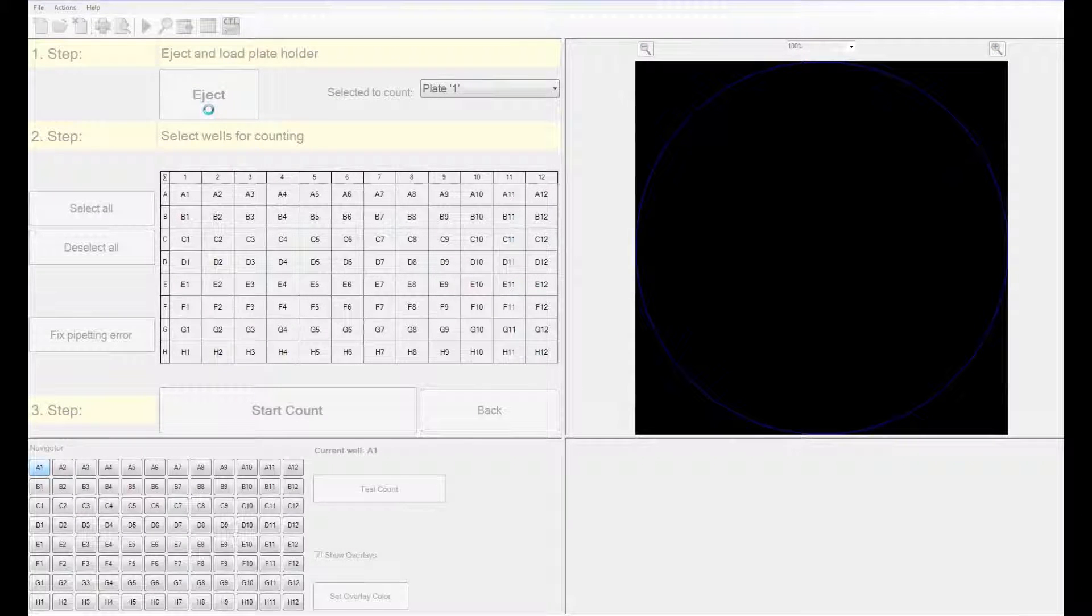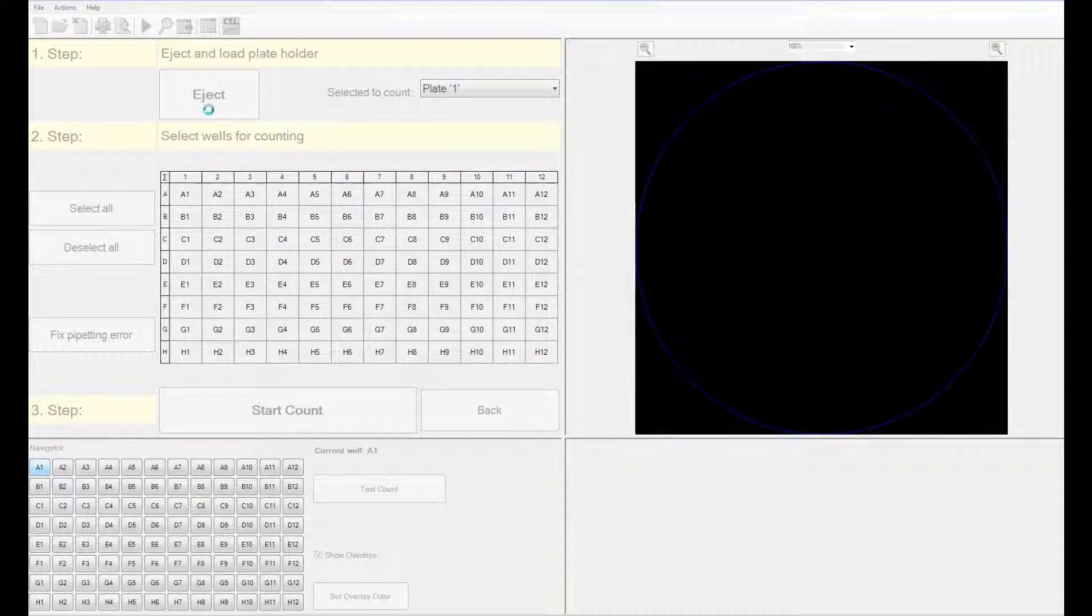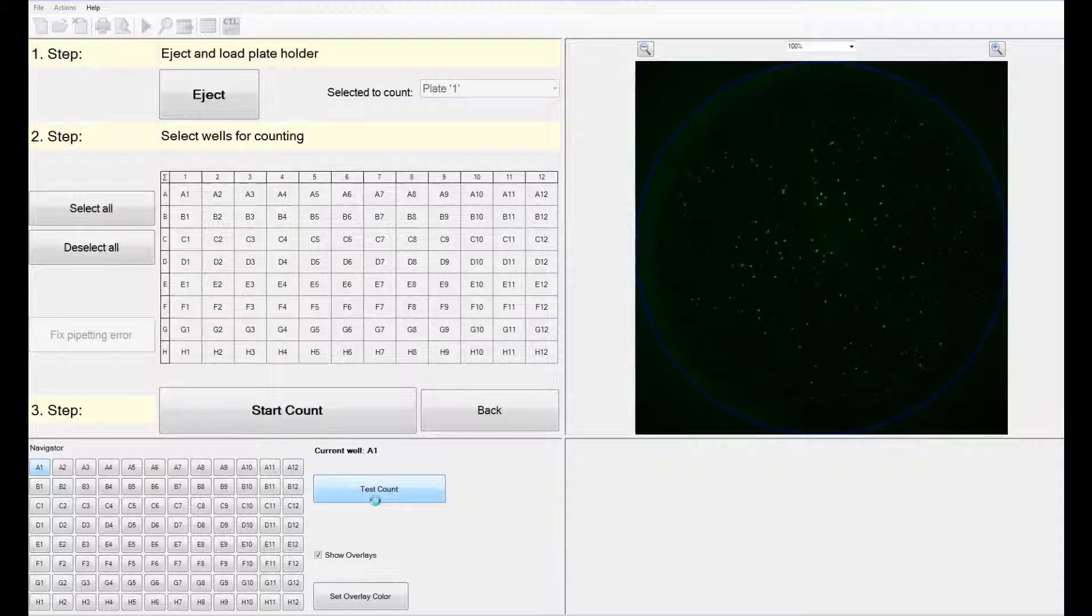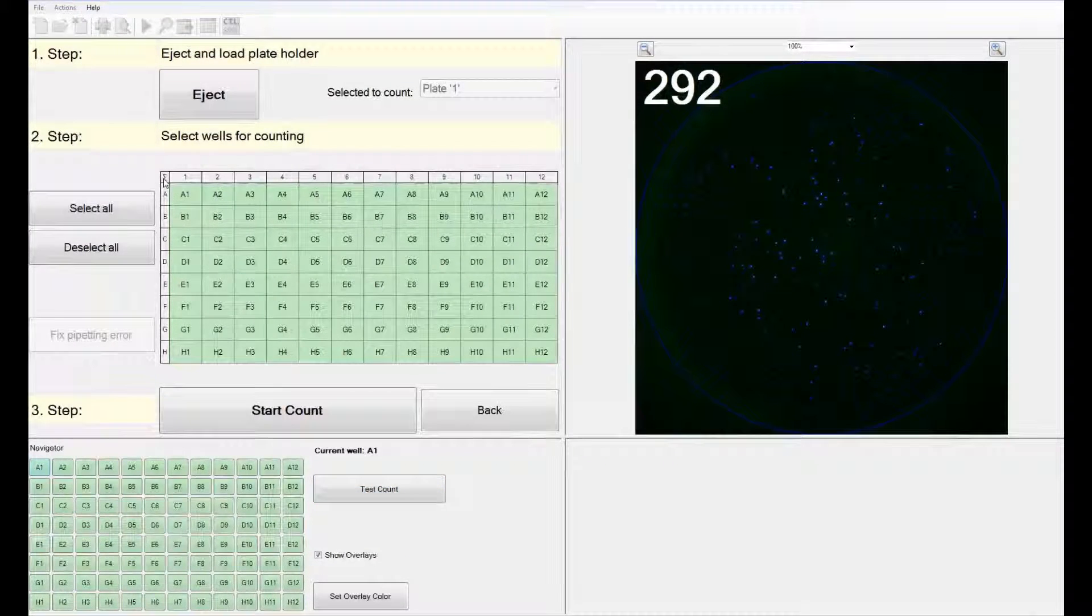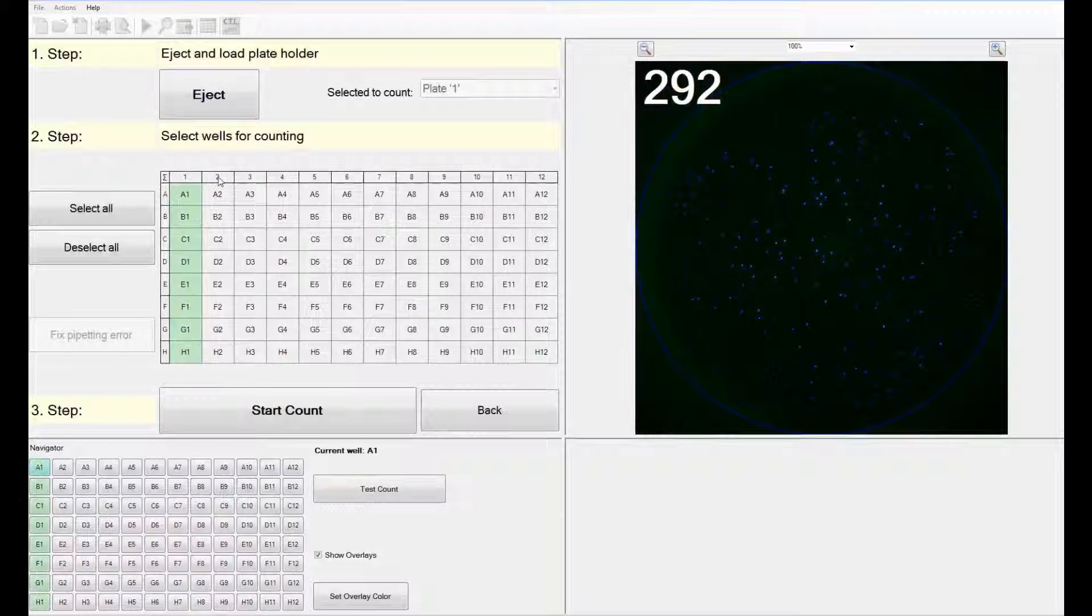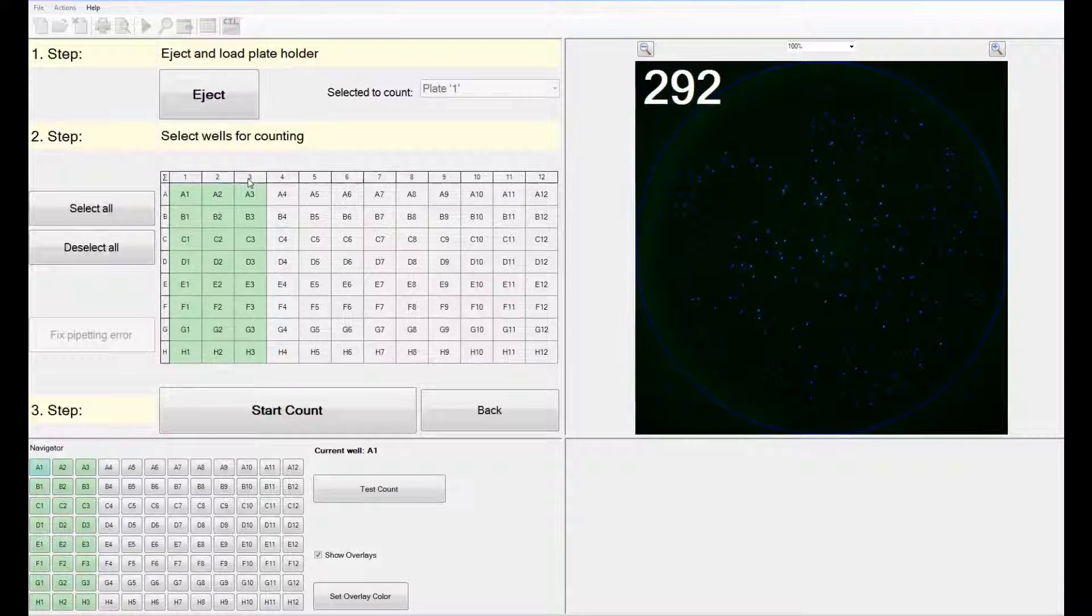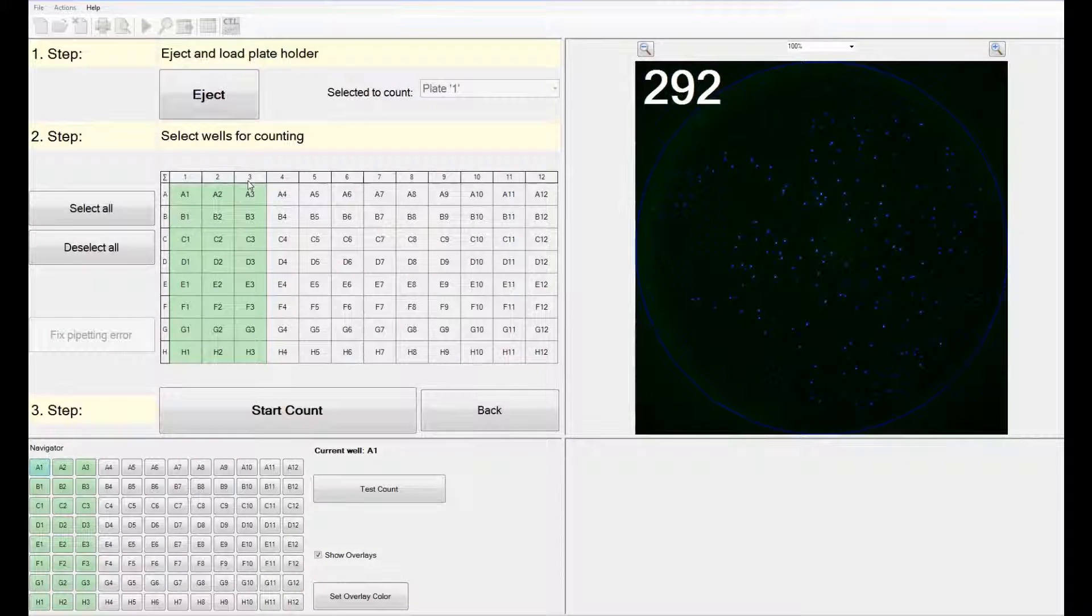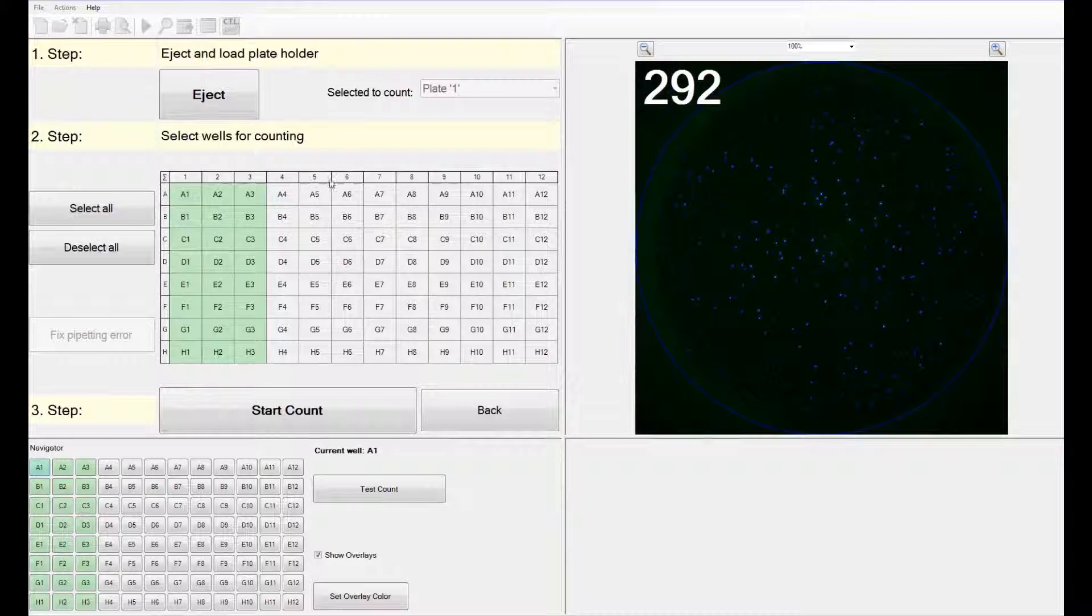You can check the counts of a sample by clicking on the test count icon in the navigation window. You can either select all the wells or the wells corresponding to the number of donors that you would like to test. The first three columns, if you remember, represent donor number 1, columns 4, 5, and 6 represent donor 2.